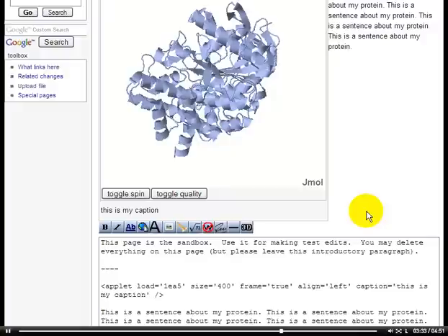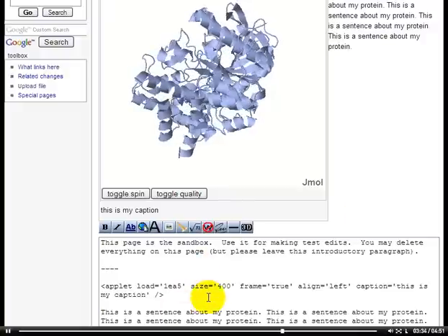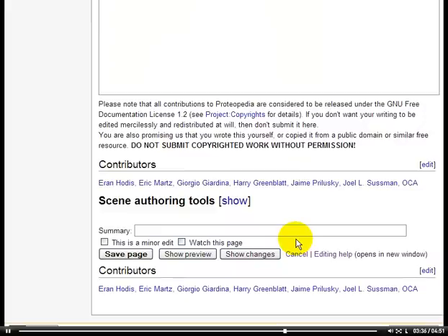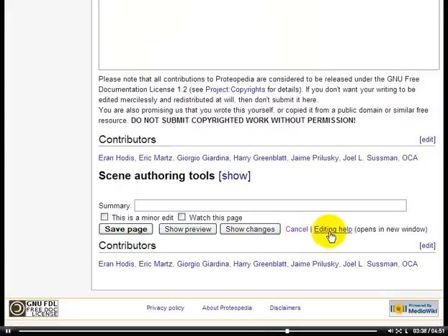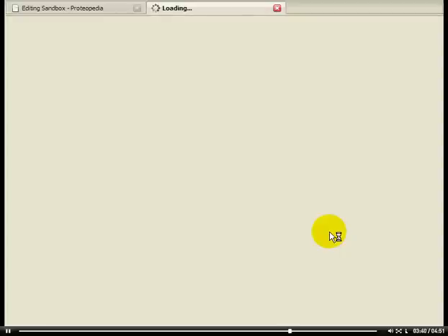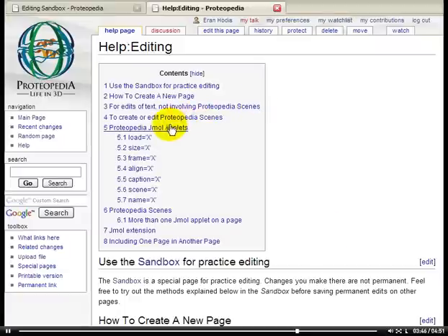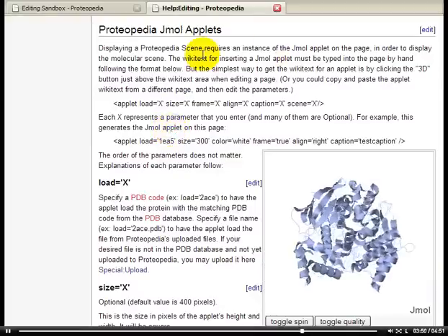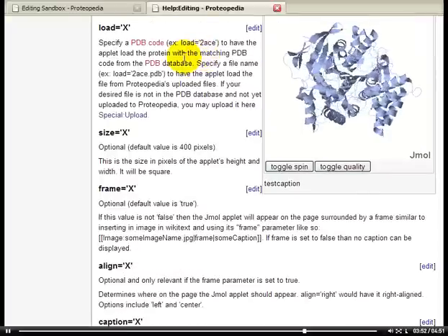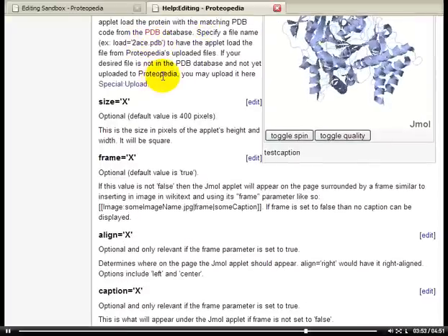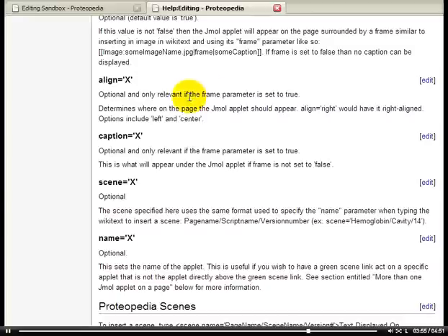For a more detailed explanation of the parameters of the applet, we can visit this link, editing help. When we click on editing help, it will load, and there is a section on Proteopedia Jmol applets. Visiting this section, we can read about all of the parameters in detail, as well as a few, like scene, that I didn't mention yet in this tutorial.